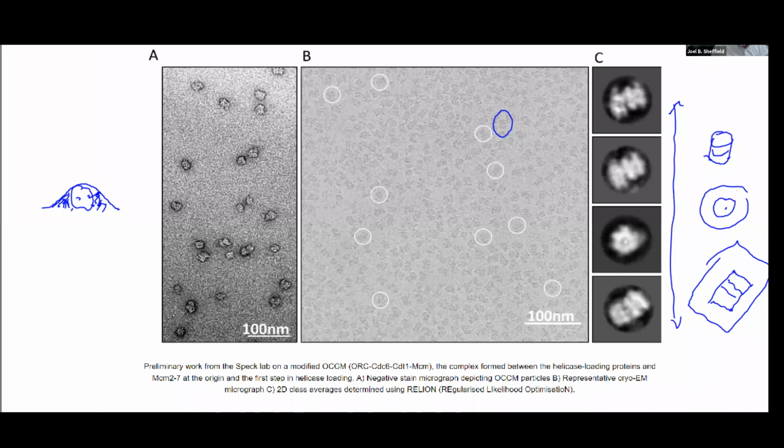Well, this is where Joachim Frank and Henderson together wrote a series of computer programs, image analysis programs, that basically take these images, break them up into individual parts, automatically classify them, set them up into specific groups based on their shape, and then generate these kinds of images. So then you can take these kinds of images and start to work more to extract little bits of data from them.